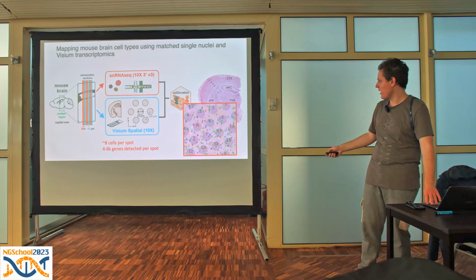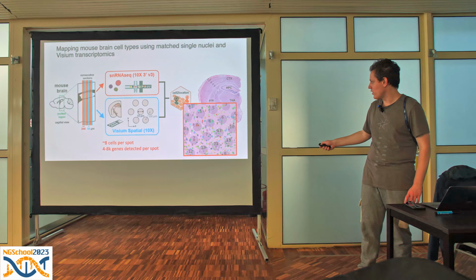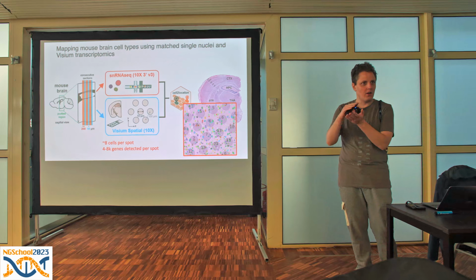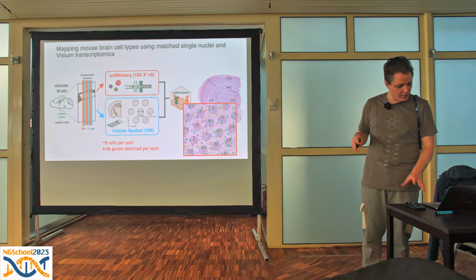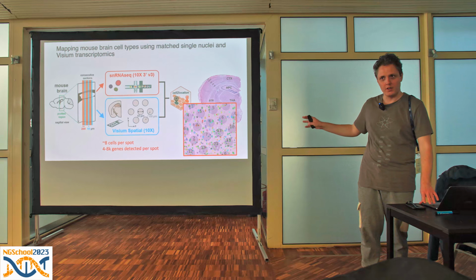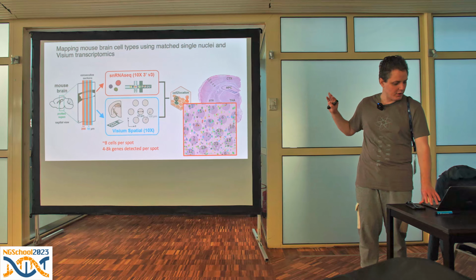So we can look at the histology image and count nuclei, but it doesn't really make sense to assume that we captured RNA from discrete 6 cells, discrete 13 cells. We captured RNA from that area, but we captured it from 13 partial cells. This is just one caveat: you shouldn't really interpret the abundance from either our method or pretty much anyone who analyzes this type of data as exactly cell numbers. But let's get back to the astrocyte point.